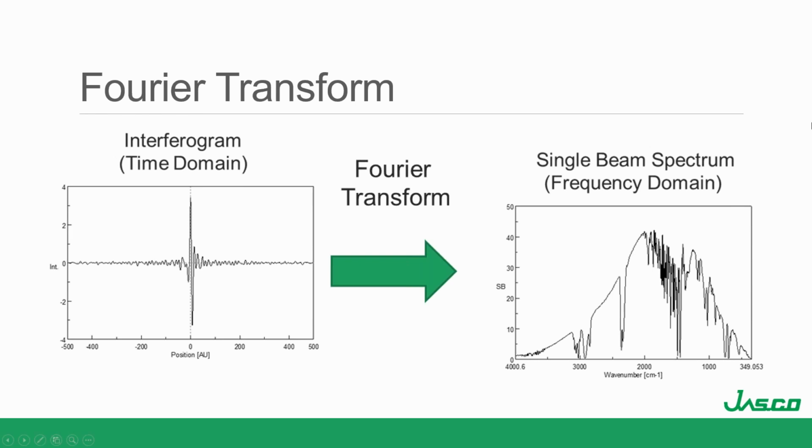That interferogram is in the time domain. It comes out as mirror position, which, if you know the speed of your mirror and where your mirror is, you can convert to time. And then it undergoes a Fourier-transform, which is a pretty complicated equation that takes about a page and a half worth of calculations for each data point by hand. So this is the reason why this technique didn't become popular until we had personal computers. As the computers got smaller, it was easier and easier to do this technique.